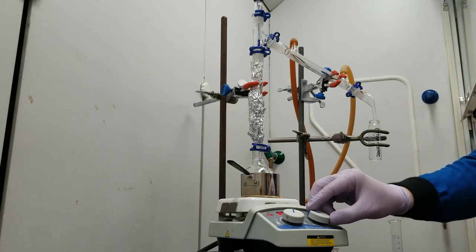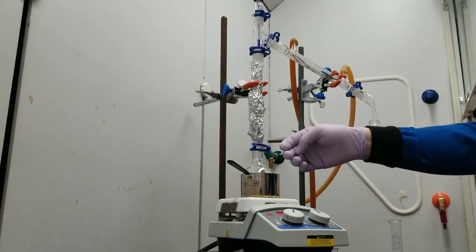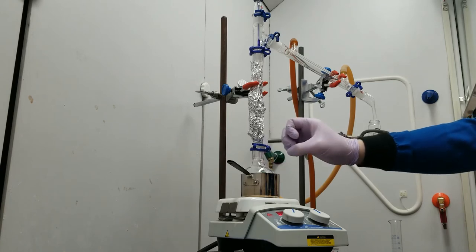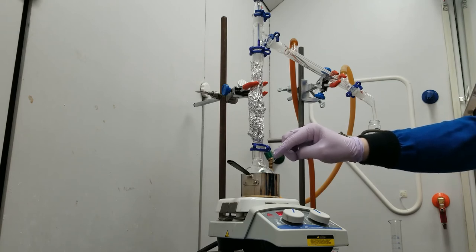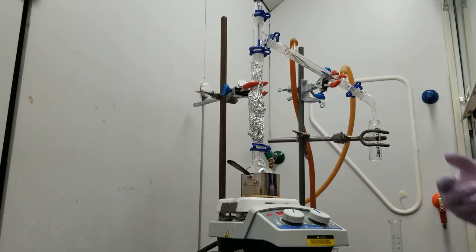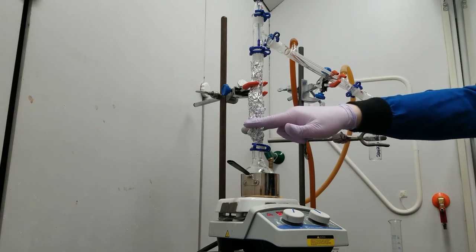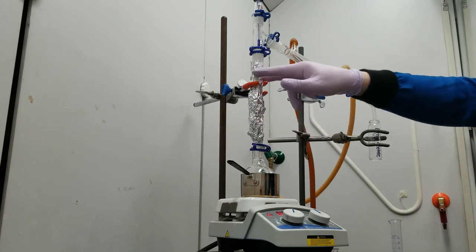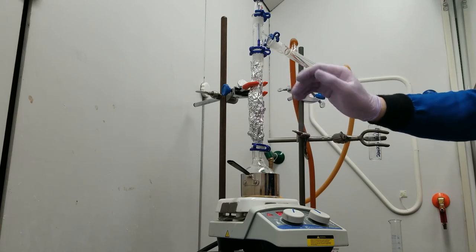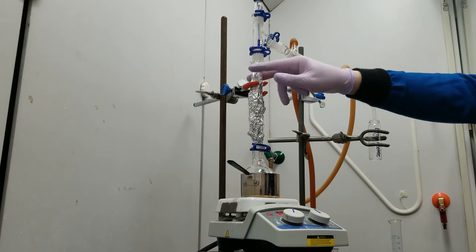Turn the stirring on. And very soon I would expect to see some fogginess in the glass here, as the vapors begin to escape the liquid and condense on here. And then I can actually monitor the progress of this by feeling the aluminum foil, and it's going to heat up depending on how high the vapors have gotten and heated up that copper. When they've heated up all the copper, I'm gonna be able to feel the heat right here.